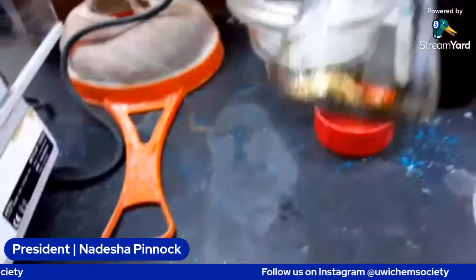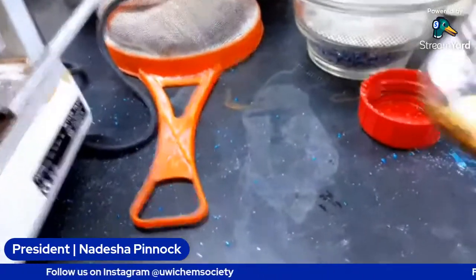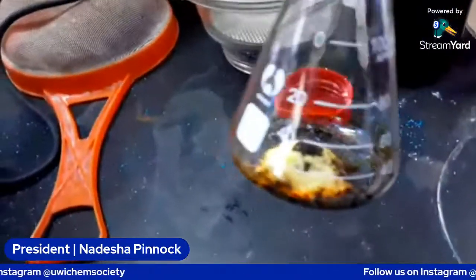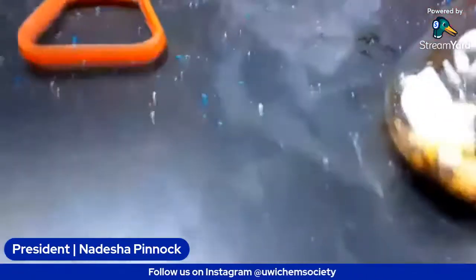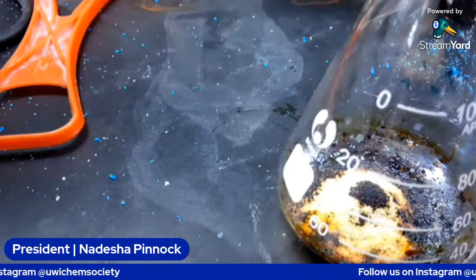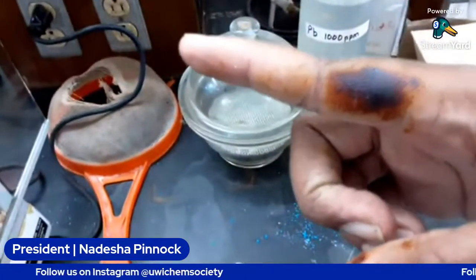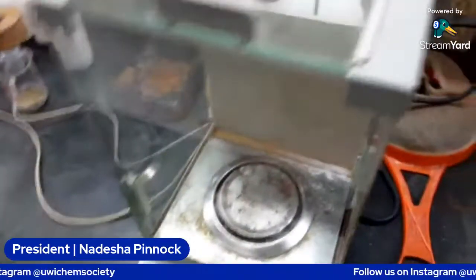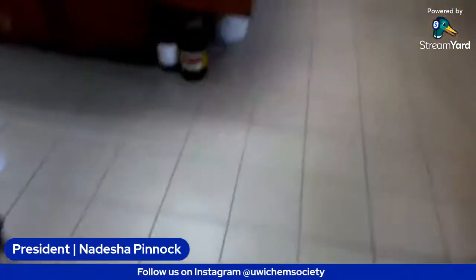So this is what we currently have. That color, of course, is the iodine. And then we're going to dissolve this in 50 ml of water at least. So you eventually have to transfer it to a larger container. And this is the reason why you wear gloves in the lab. My gloves are in the bag, but I forgot to put them on.